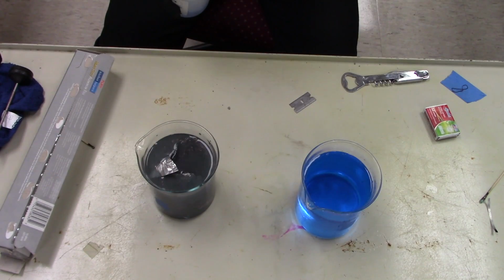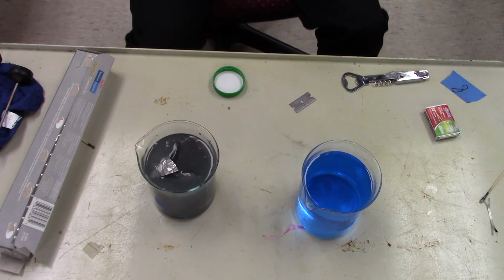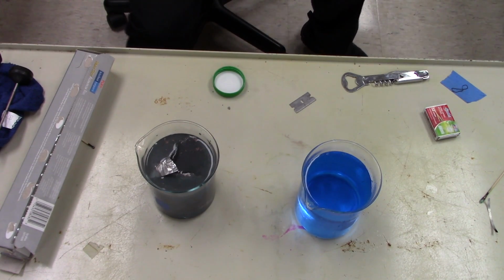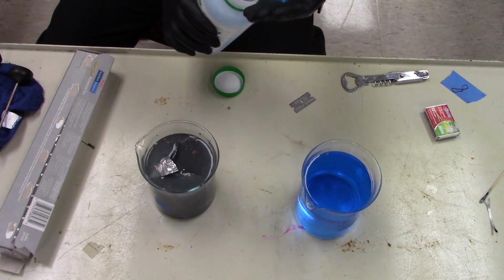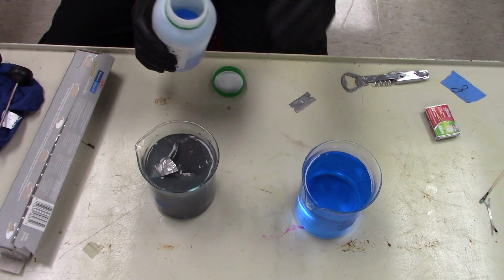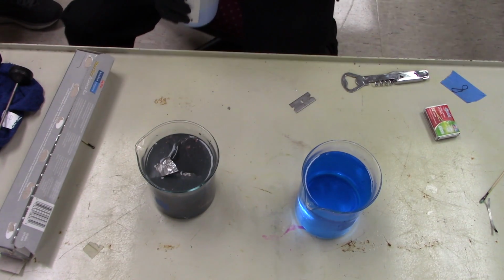You can turn that on. So inside of here, it's what we call an aqueous solution of copper(II) sulfate. So we all know what copper looks like. It looks like pennies. When you bond copper with sulfate, it's this kind of pretty lapis lazuli sort of blue color. Just put that back in there. Looks like candy, but it's not. So I just dissolved it in water here.